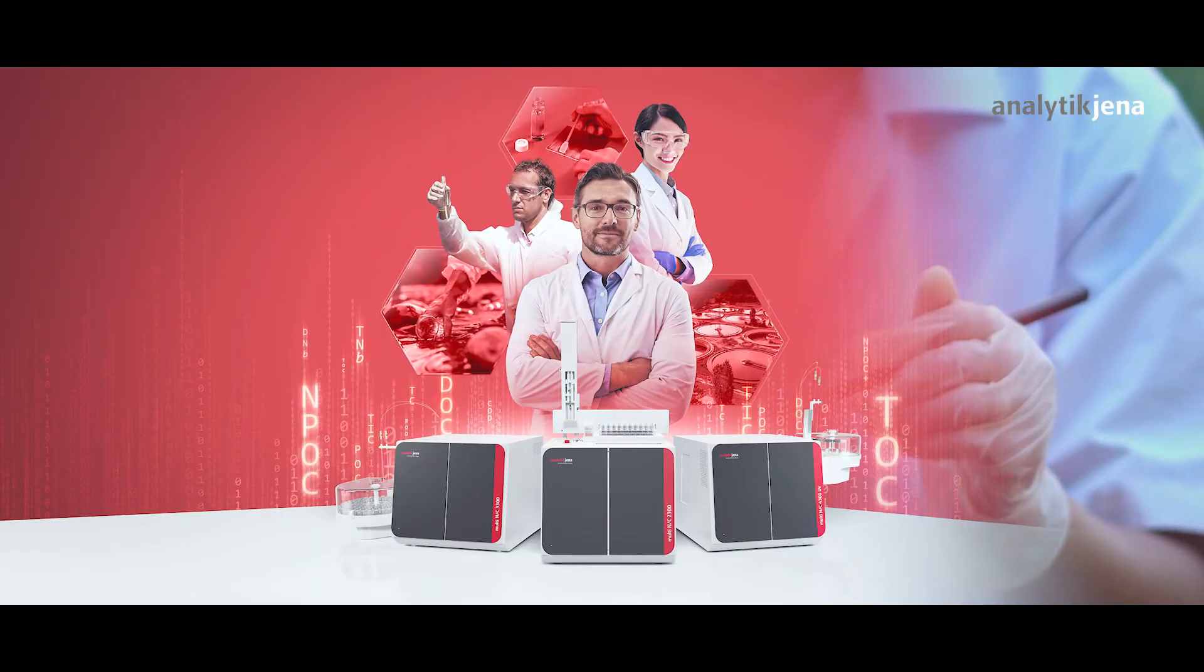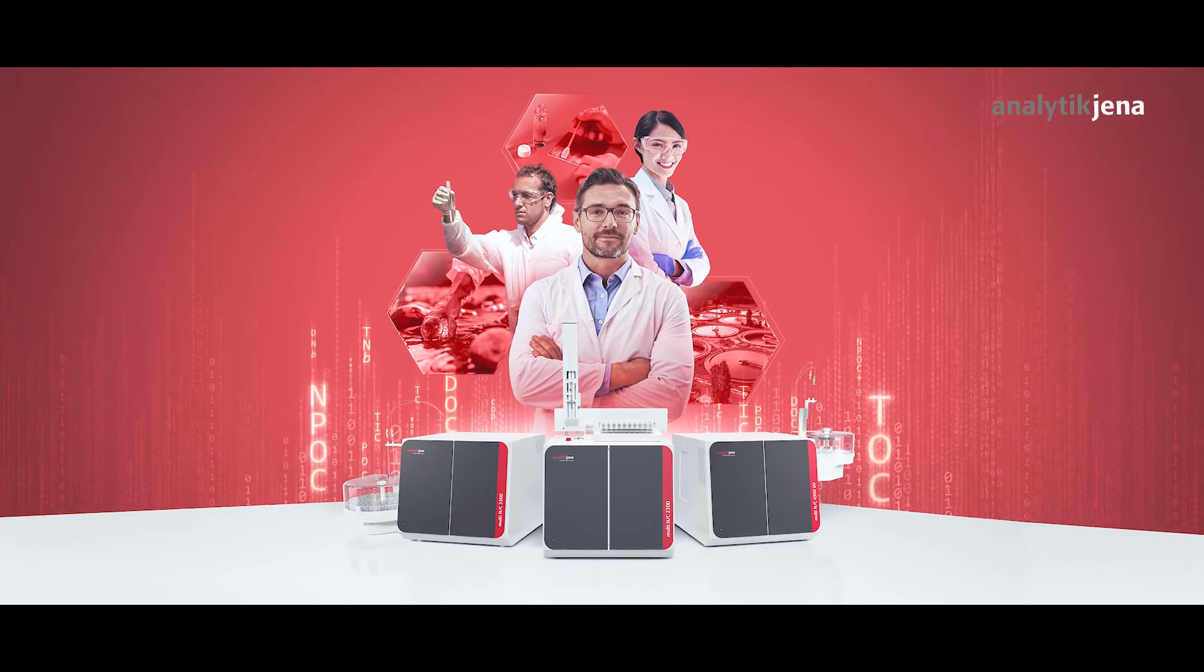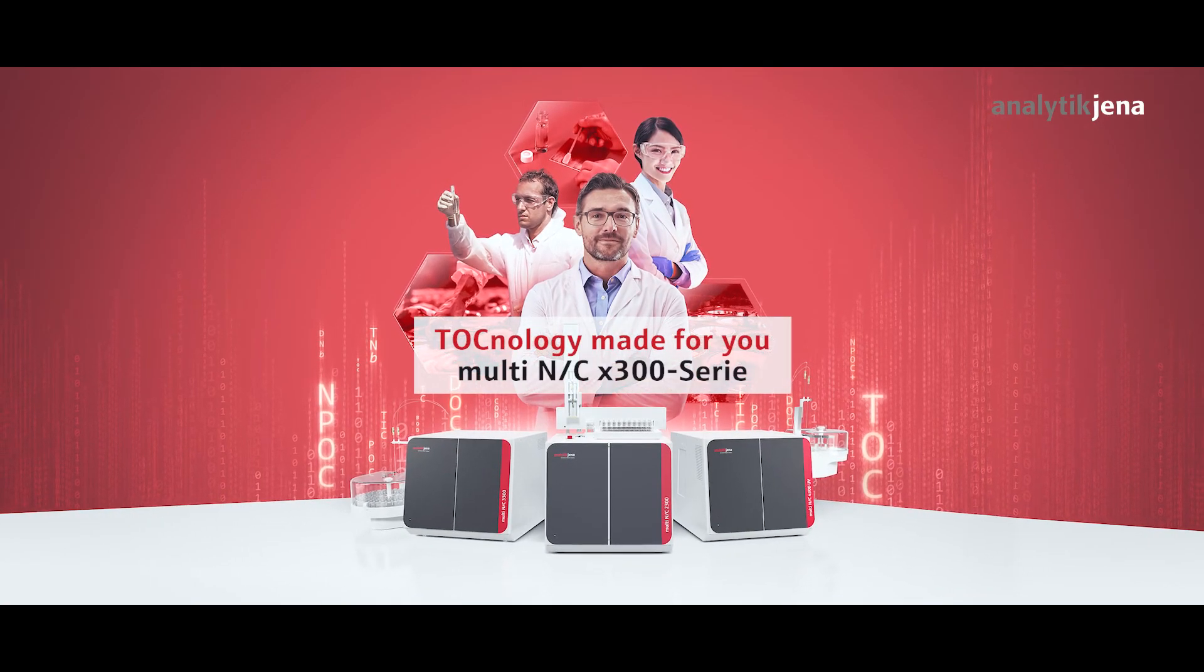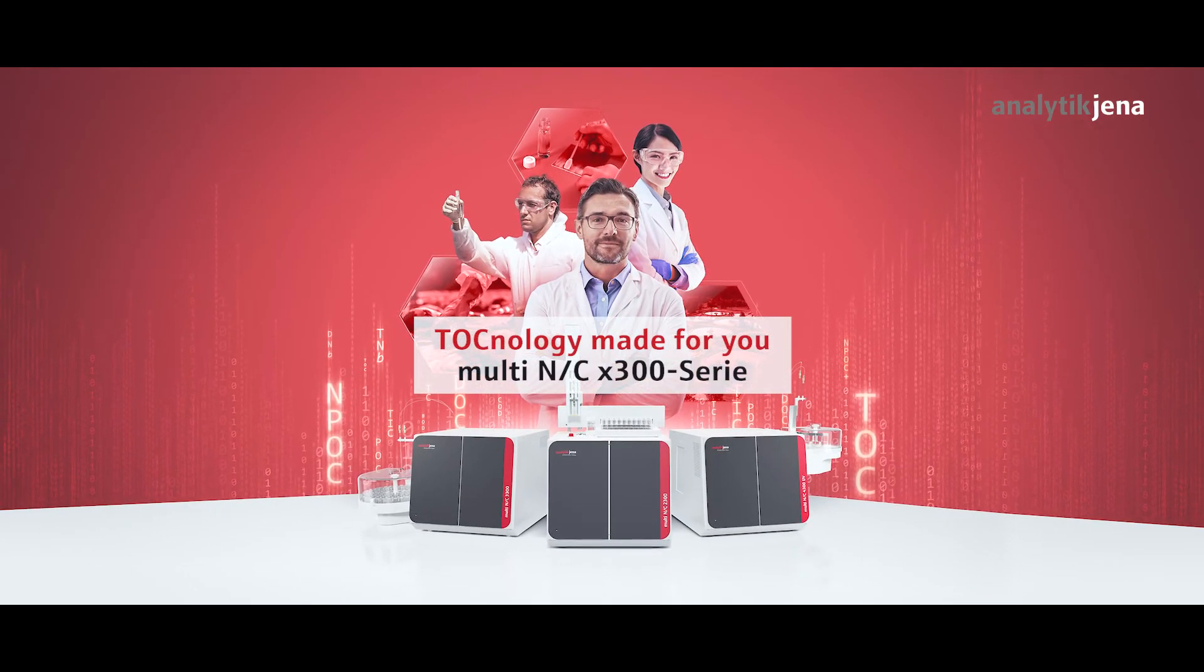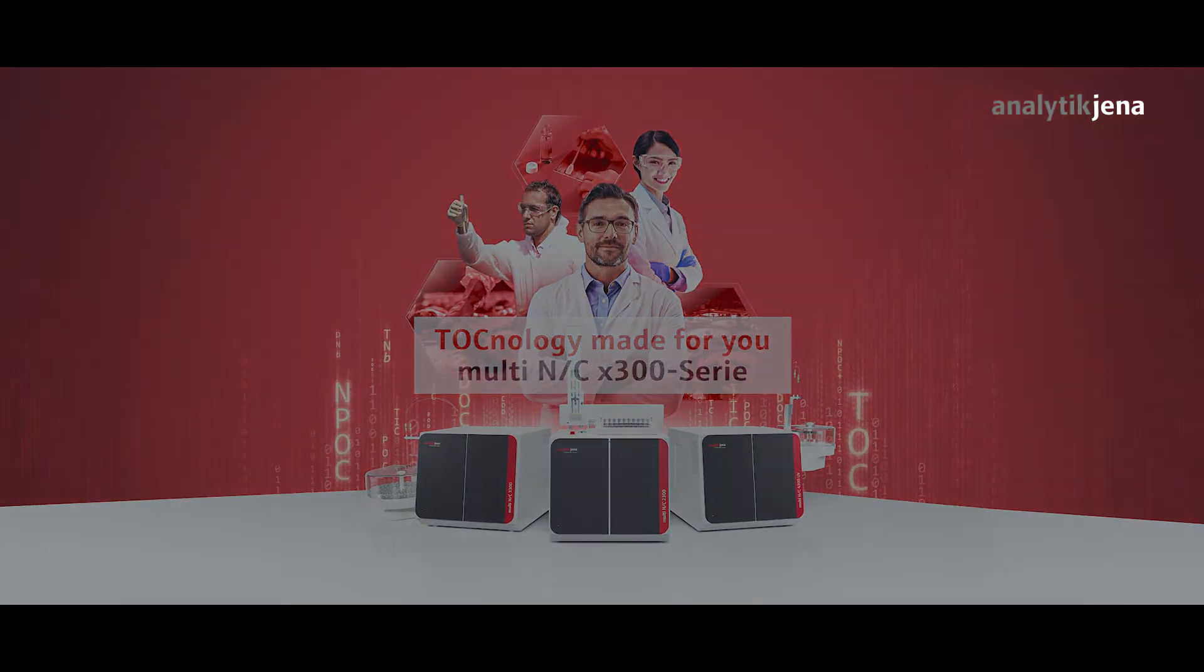Master your matrix with Multi NCX300 analyzers. Discover technology made for you. Thank you.